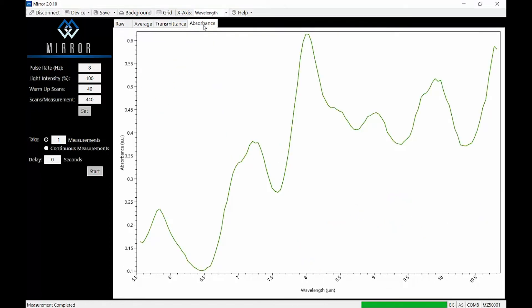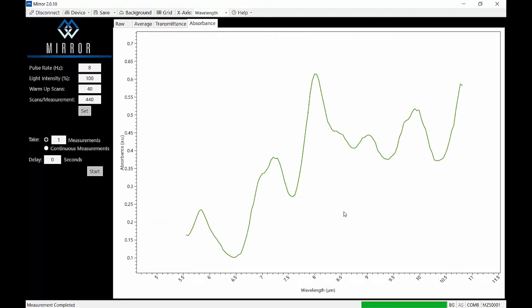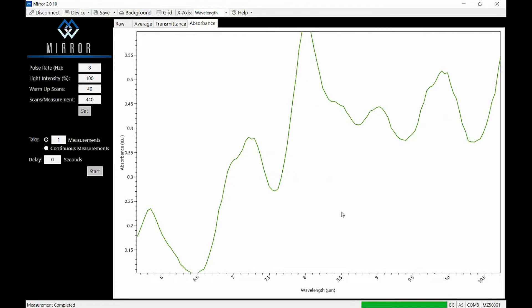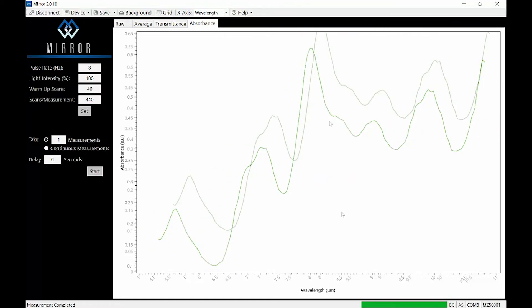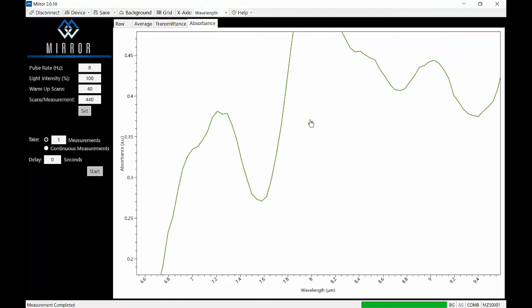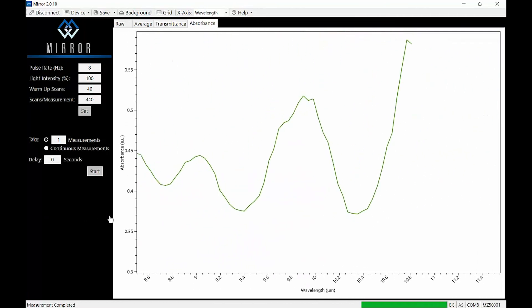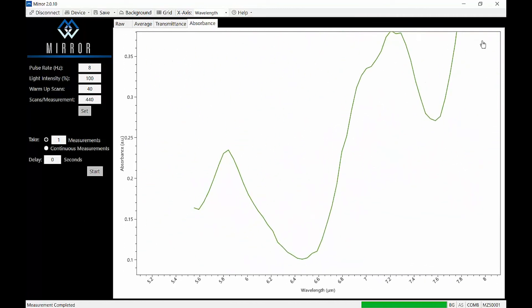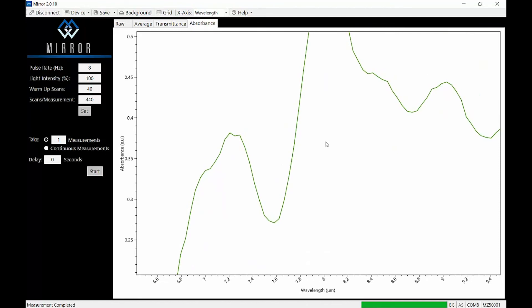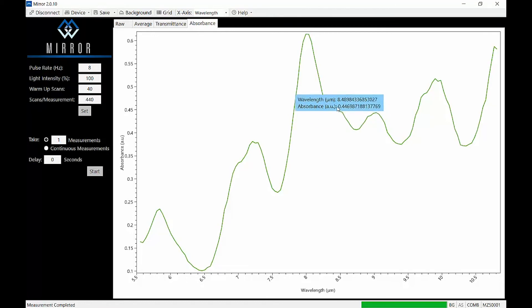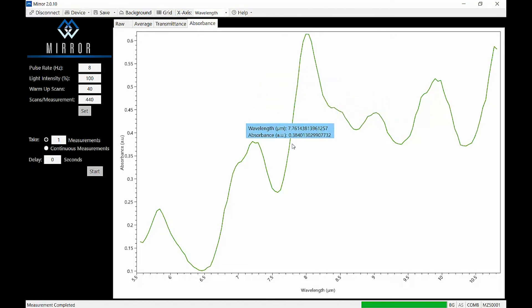If you want to customize your graph view, use the scroll function on your mouse to zoom in and out on the spectrum. You can also right-click and drag to move the spectrum around in your graph view — this is most useful after you've zoomed in. Left-click to display raw intensity, absorbance, or transmittance at a specific wavenumber.